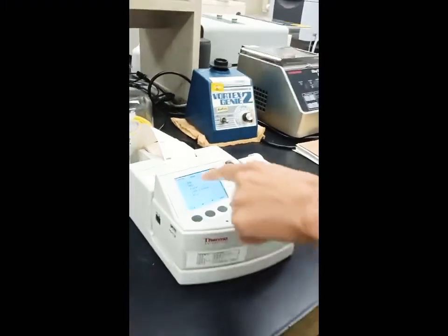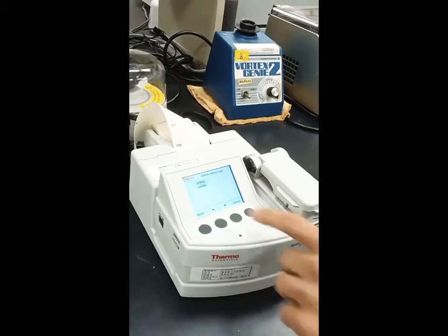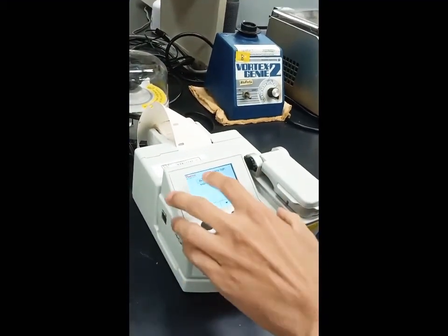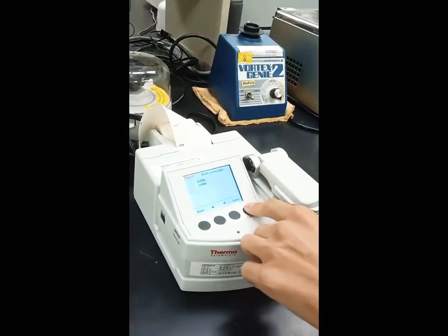First, you choose the DNA type. Since normal DNA is double-stranded, we choose dsDNA.